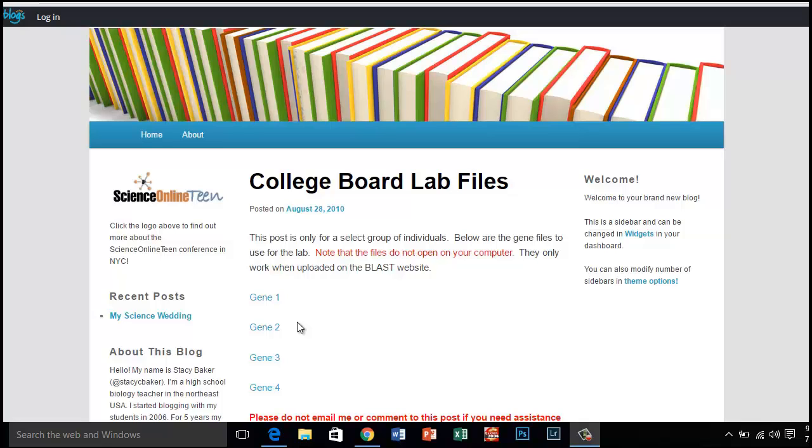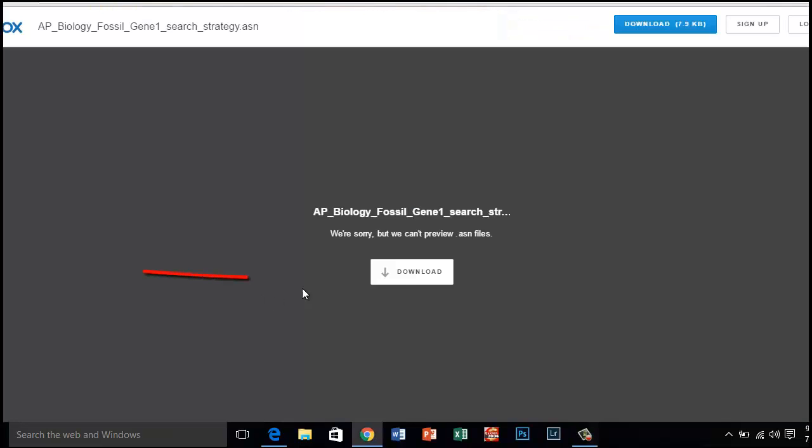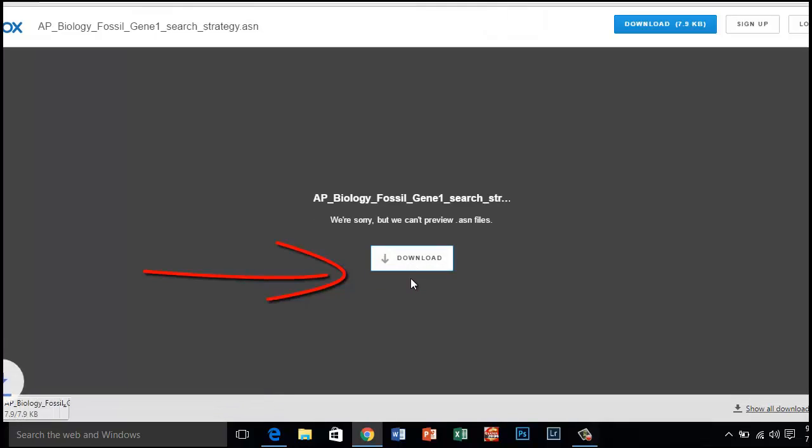Once at the site, all you need to do is to click on the gene and click download. You may want to save these files to your desktop for easy access later.